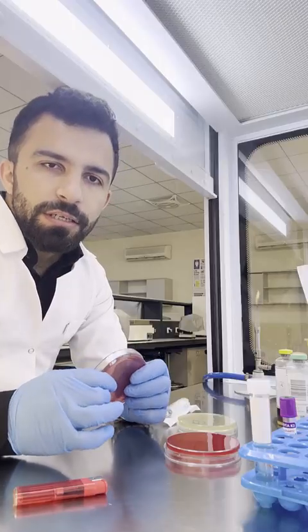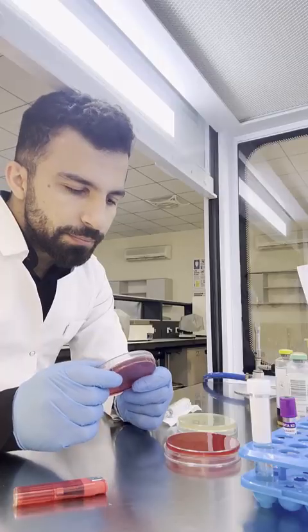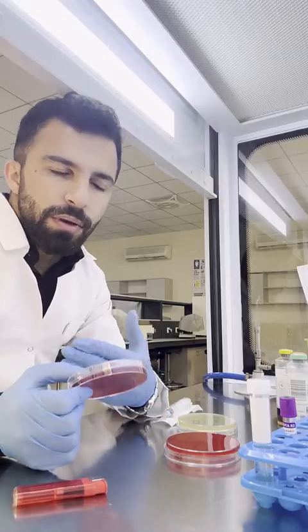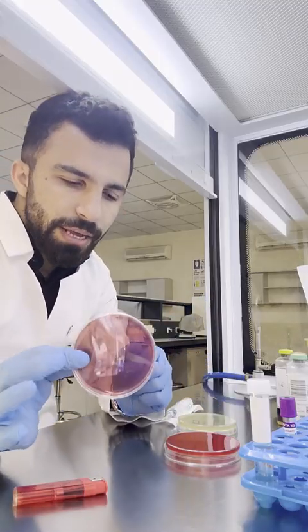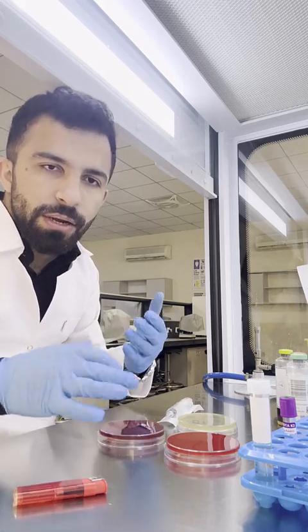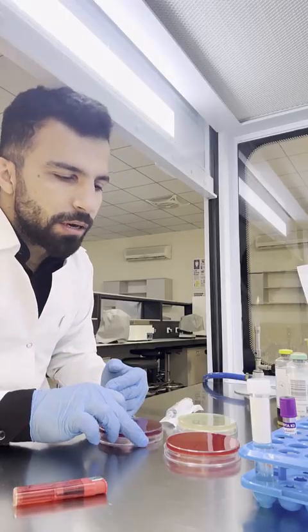There are some bacteria that have the ability to ferment lactose, like E. coli. When it ferments lactose, the color of the colonies will be pink. And non-fermenter, if the bacteria doesn't ferment lactose, the color of the colony will be colorless.